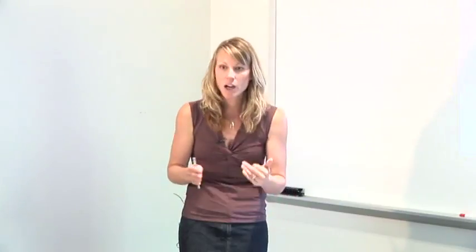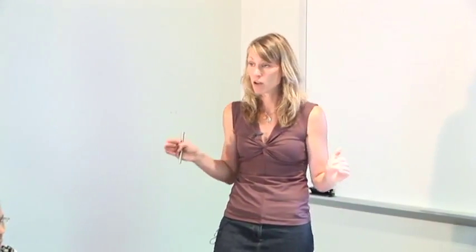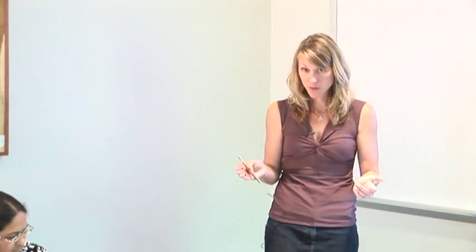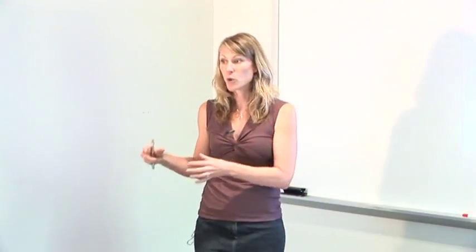So everything that I've talked about right now is very general. In general, all of the database search algorithms work this way. But there are many, many different software packages out there, and probably all of you are going to have access to different ones. They all are going to work a little bit differently, mostly in the way that they score the results.